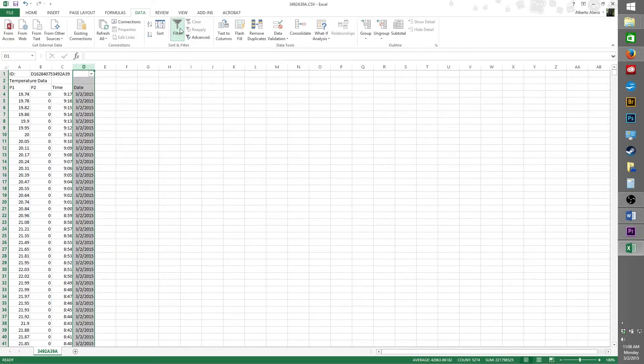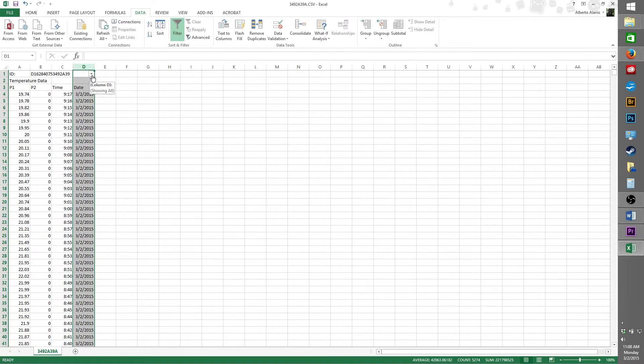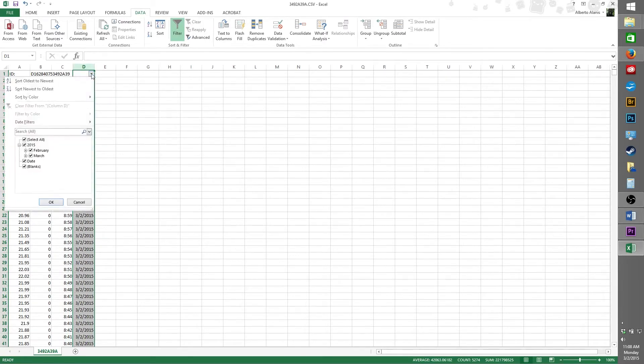Once you click filter, a small box will appear under column D. This small box indicates that a filter has been applied for this column and we can begin filtering. Click on this box to open it, and towards the bottom, you will see a list of values. These values indicate all the values currently on column D.